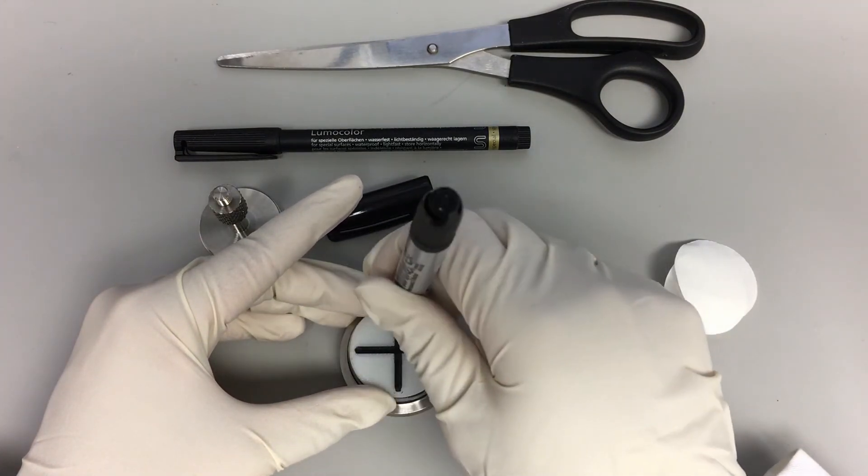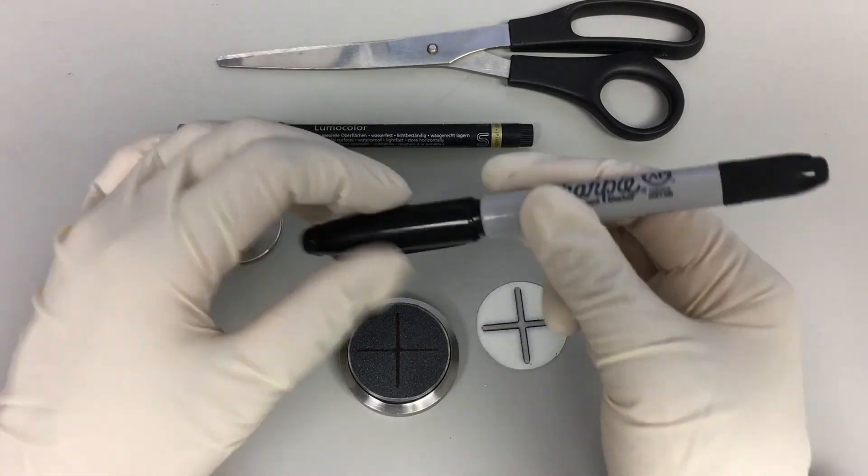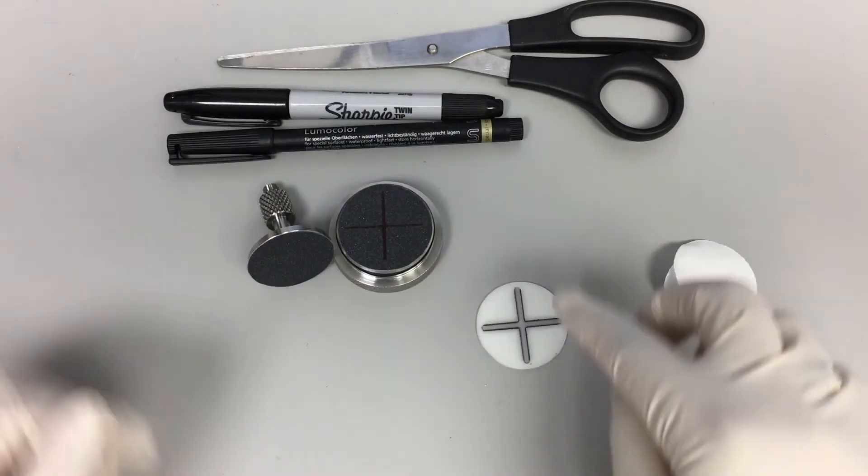If a circular stencil is not used, ensure that the cross is traced exactly in the center, for example by using a caliper.